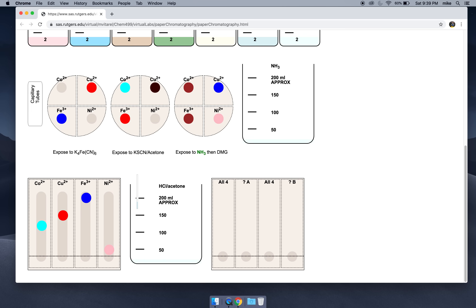So that was stage two. The last stage I'm not going to do for you — I'm going to let you play with this on your own. In this lane I have all four ions. In this lane I again have all four ions. Here I have two of the ions — I'm not telling you which two. And here I again have two of the ions. You're going to have to try to figure out what those two ions are based on everything we've learned so far. That's the instructions, and for those not in the course, I'll post a link to the virtual lab below.